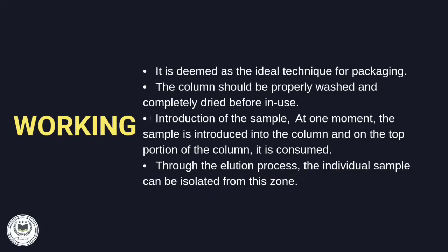What is the elution technique? Through this technique, the individual components are separated completely from the column. For this, two types of elution techniques are there: isocratic elution technique and gradient elution technique. In the isocratic elution technique, throughout the procedure a solvent of the same polarity or same solvent composition is utilized. For example, use of chloroform alone. And then comes the gradient elution technique. Throughout the separation procedure, solvents of gradually increased polarity or increased elution strength are utilized.